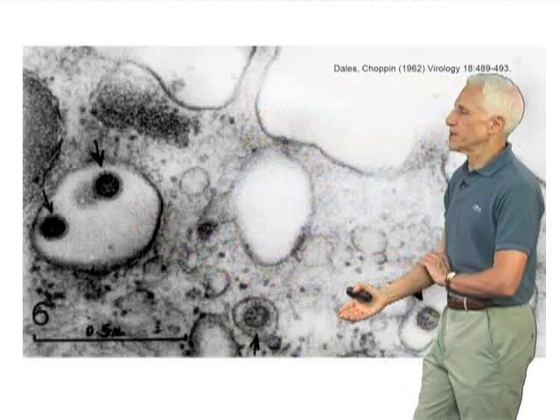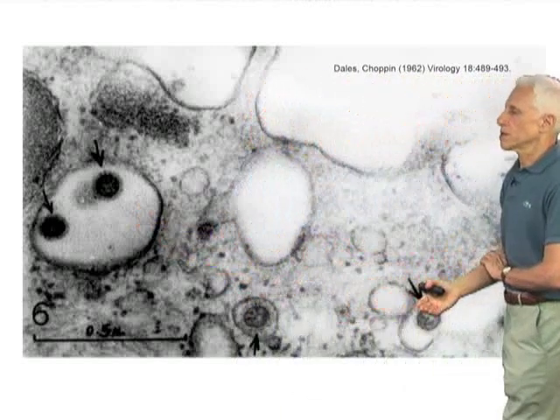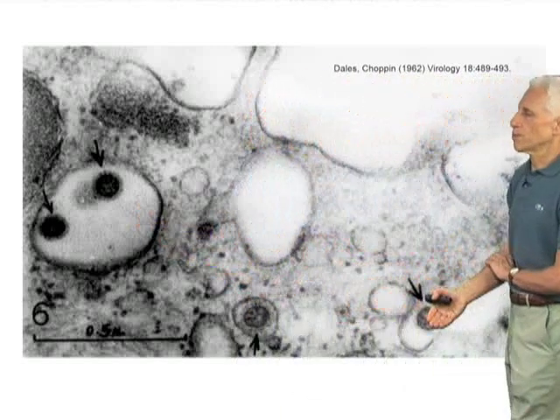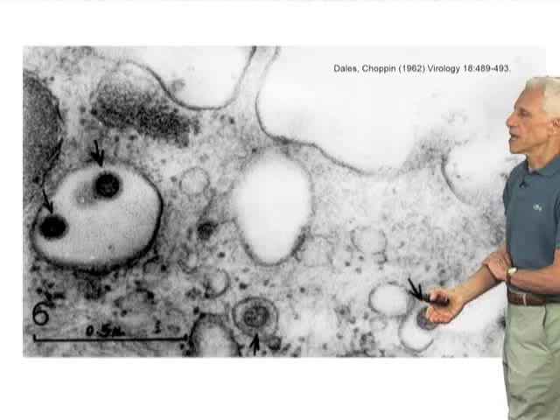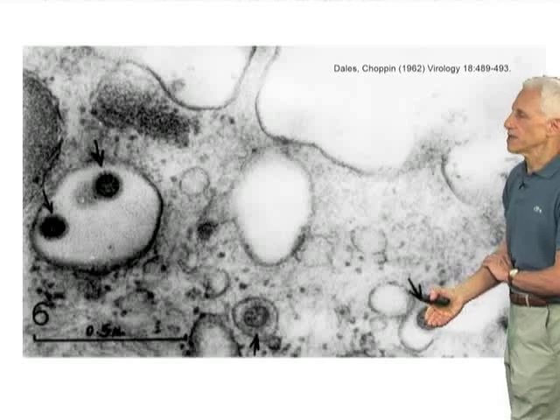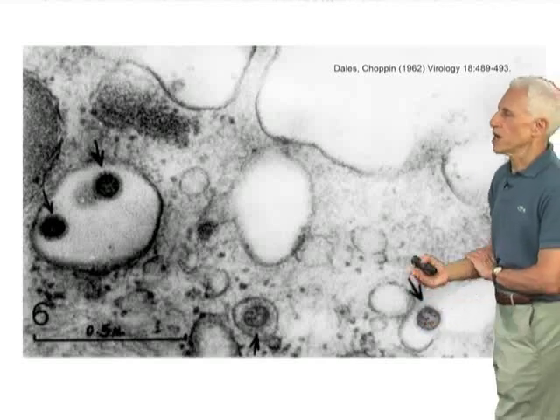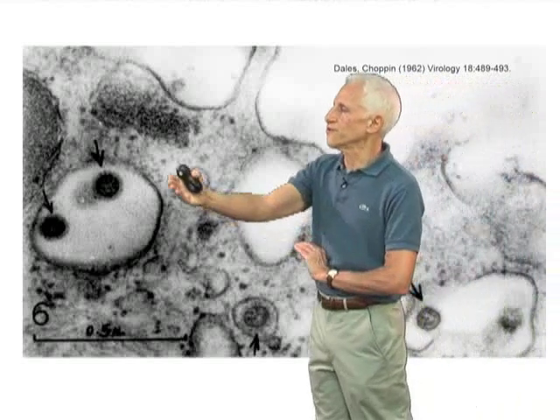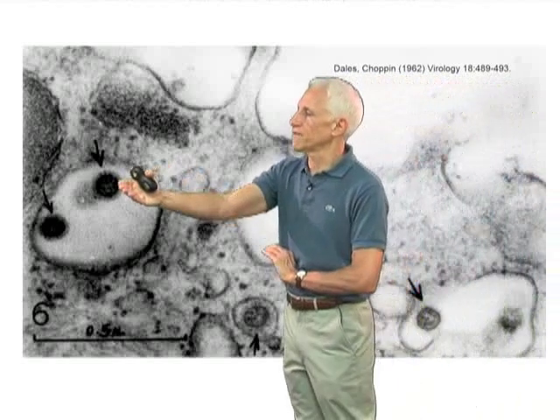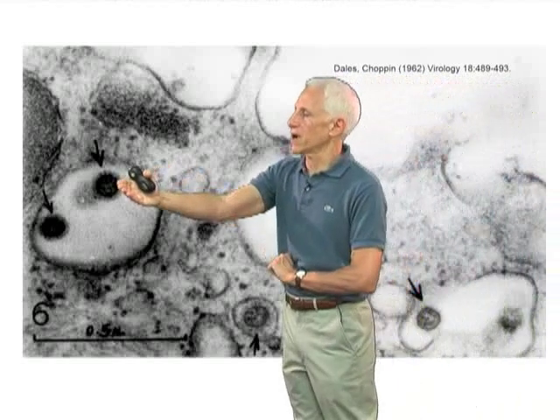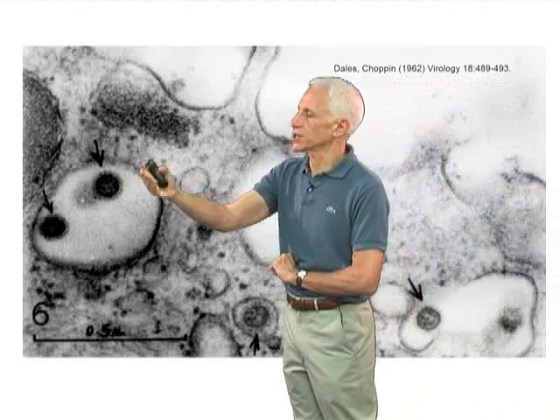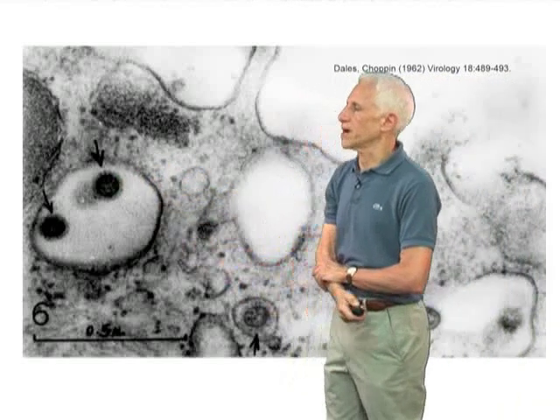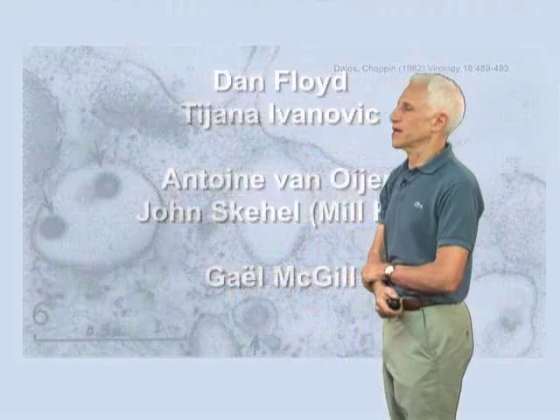You can actually see some of them in cross-section here, probably into the cytoplasm through fusion of the lipid bilayer of the virus with the lipid bilayer of the endosome.